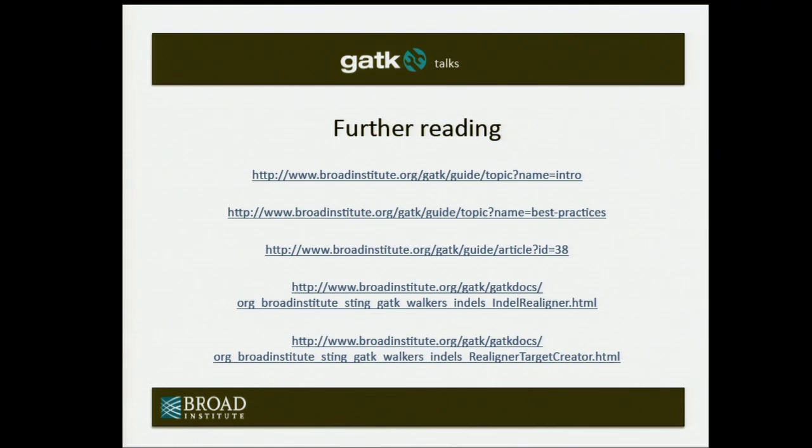Generally, for shorter indels, most of the reads will get mapped, and I think Ryan will show you screenshots. What usually happens is that BWA will map the read up to the indel and then soft clip off those bases so they're hidden. So they don't actually get unmapped. They just get partially mapped and then cut. And Ryan's tool will uncut them and figure out what's really going on there. So you don't really need that.